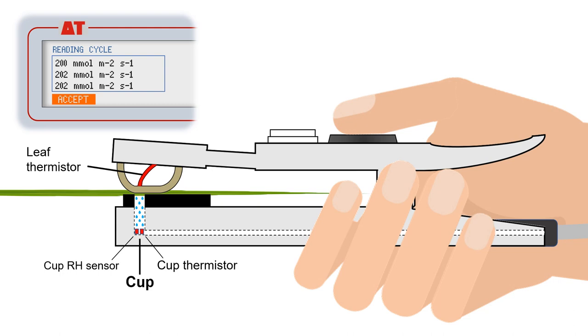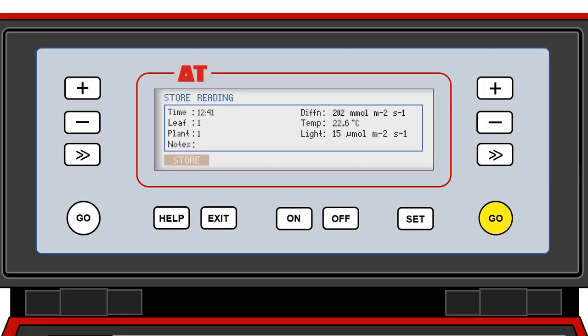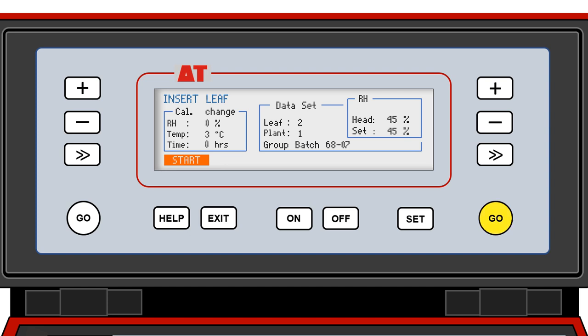Once accepted, the user stores the reading by pressing the Go button. Text notes can be added with the full-size keyboard. Pressing the button again enables the user to start measurement on another leaf.